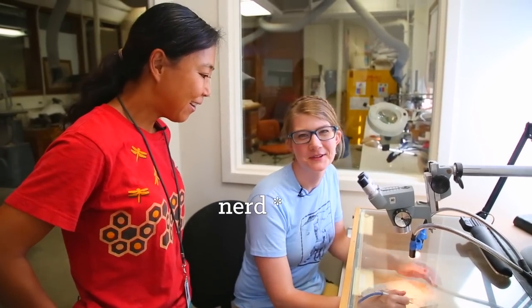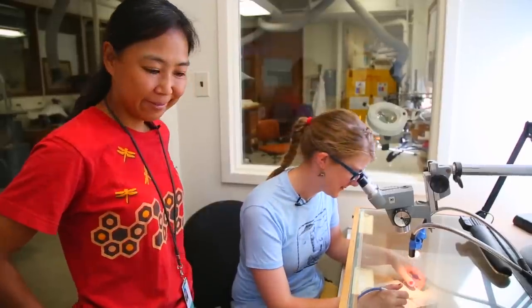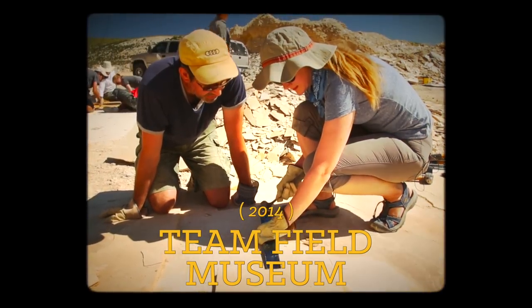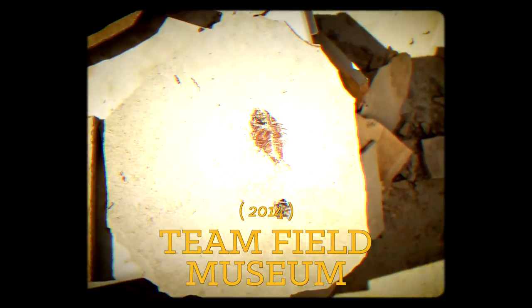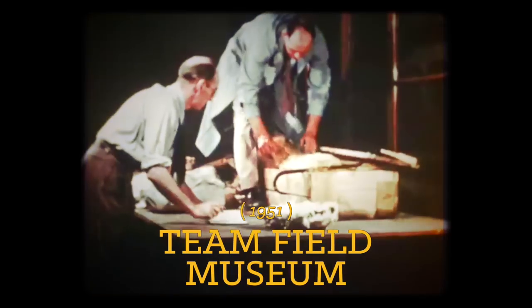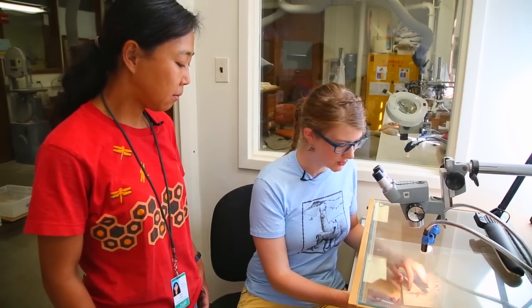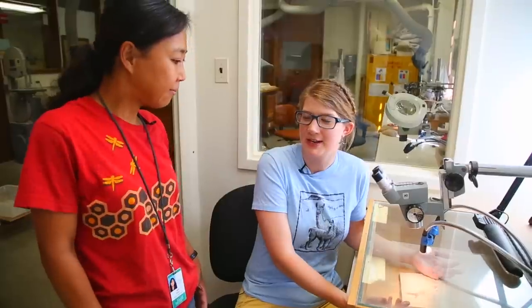You get that pun? Ha ha! I mean, it's just cool that we got to go to Wyoming, be there in the field excavating these fossils, and then bring them all the way back here and see all of the work that goes into preparing them. We've probably been here for an hour and I've got a square inch of fossil work done. So it gives me a better appreciation for the giant dinosaurs that are on display, or even the rest of the fish.